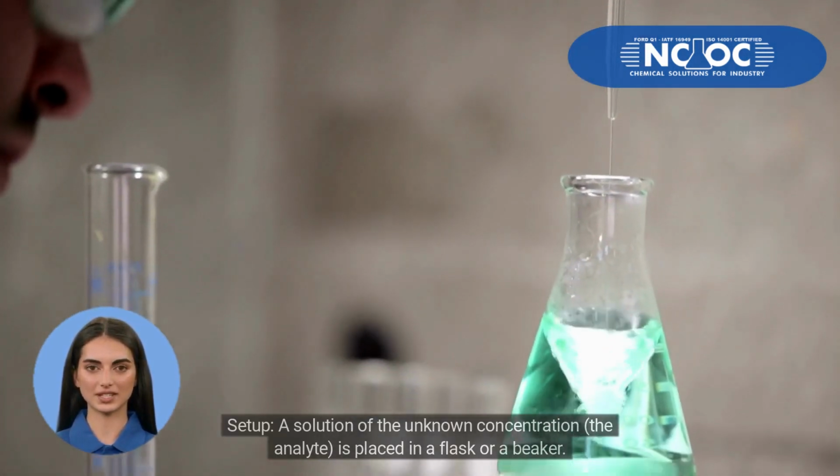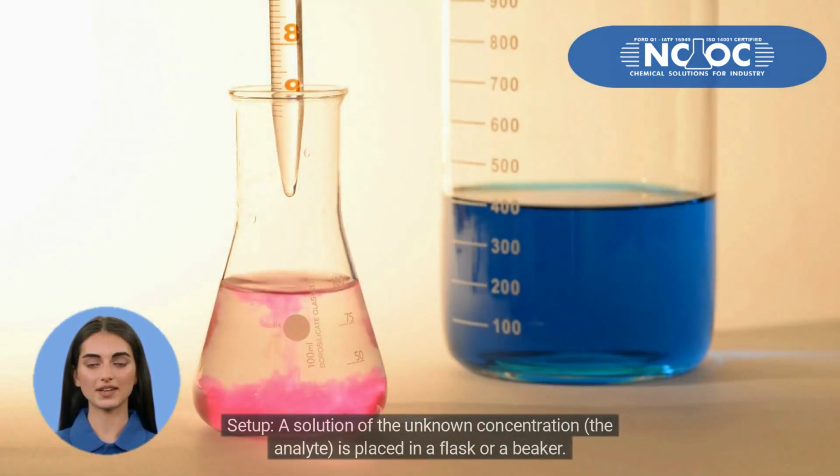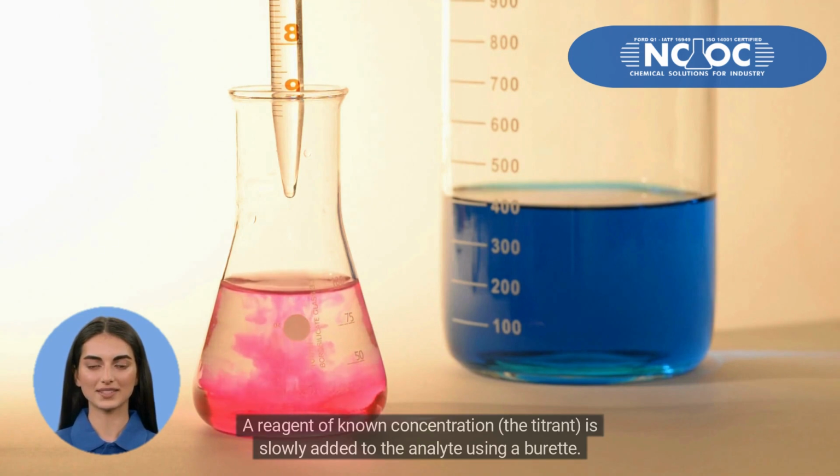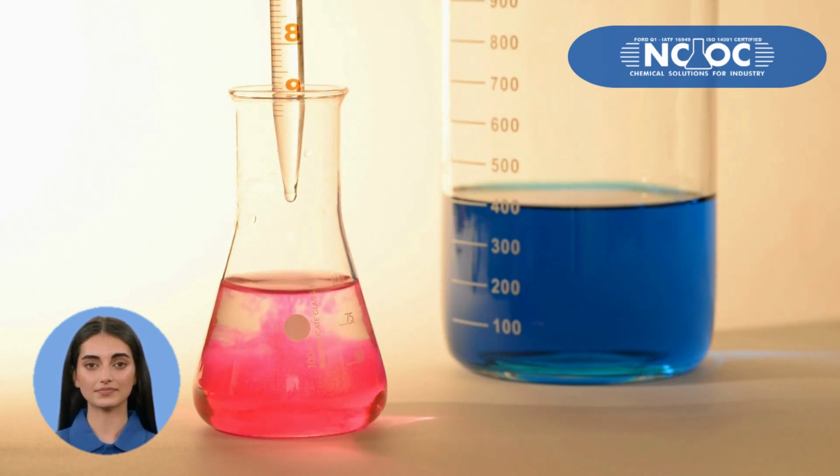Here's a general outline of how titration works. Setup: a solution of the unknown concentration, the analyte, is placed in a flask or a beaker. A reagent of known concentration, the titrant, is slowly added to the analyte using a burette. The titrant reacts with the analyte to produce a new compound.